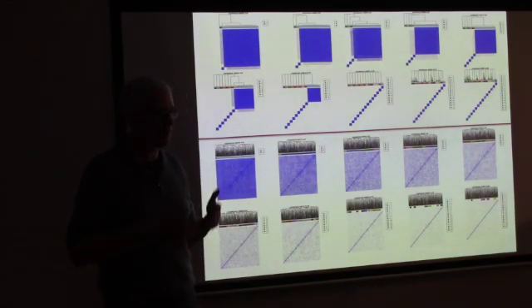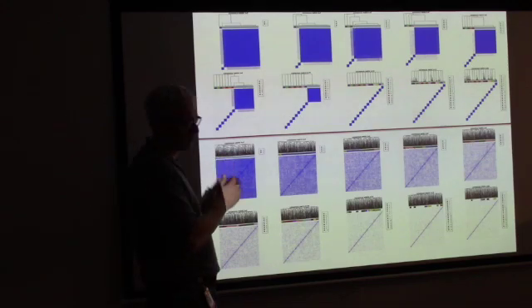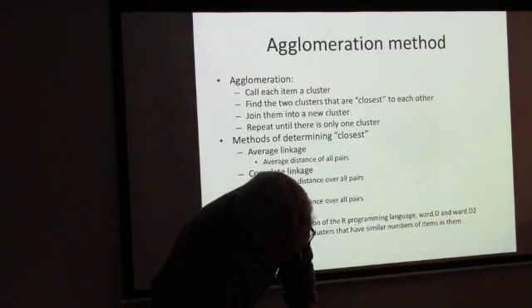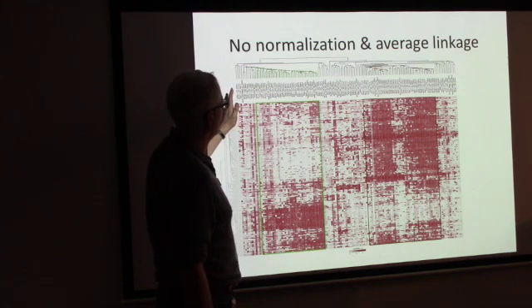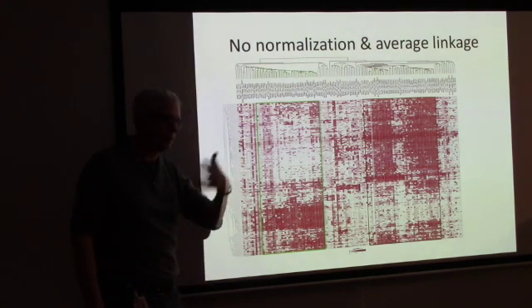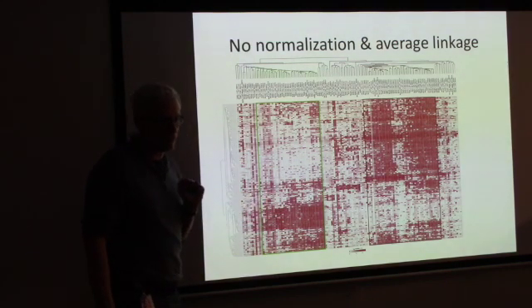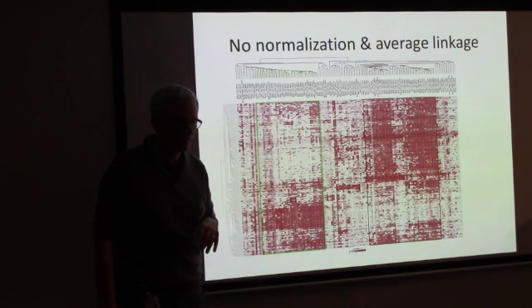So you may have 3,000 samples. It is very hard to make the kind of clustering. Let's go back. This is less than 100. So you can imagine what an unreadable mess it is if you have 2,000 or 3,000 cells.